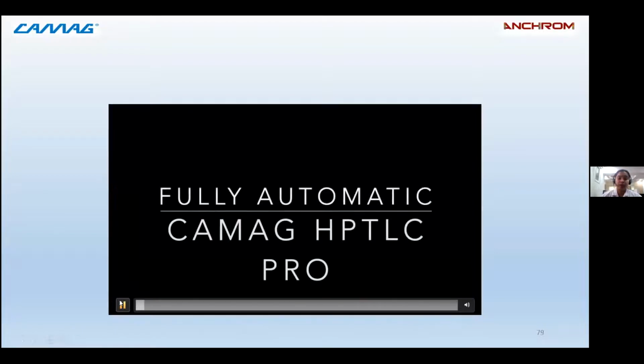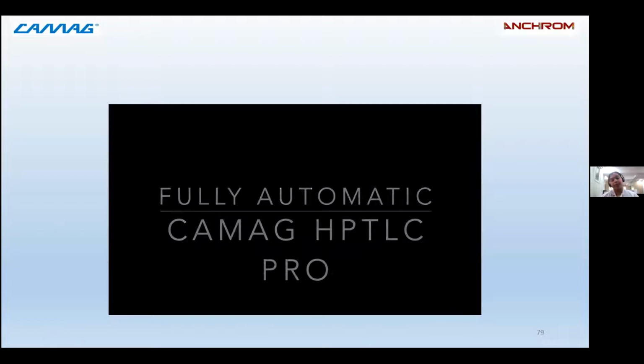So 5 modules will be launching. Till now 2 modules have been launched and 3 more have to be launched in the next coming 3 years. And this is the working of an HPTLC Pro unit in our lab.